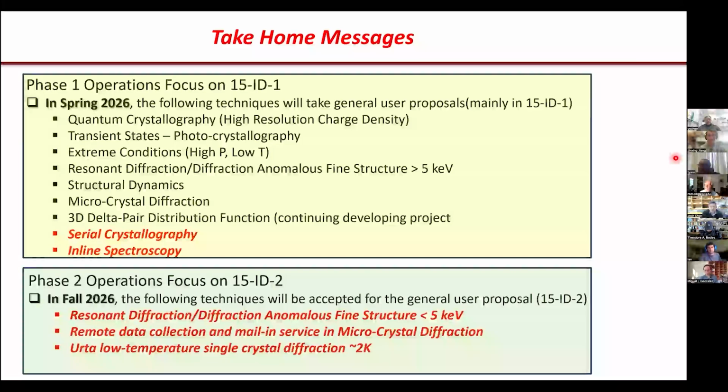without losing any intensity. That's the beauty of the new upgrade of the APSU, because they reduced the beam size. So we can pretty much use the total flux, the whole size of the flux from the beam. We don't need to cut it down, because normally before, in the ID, you were here, right?